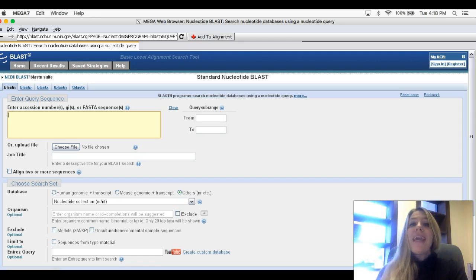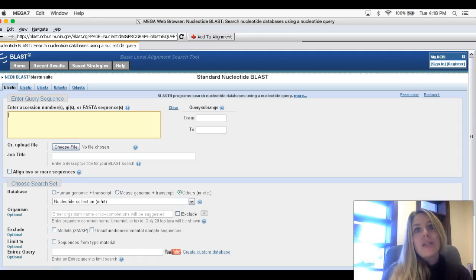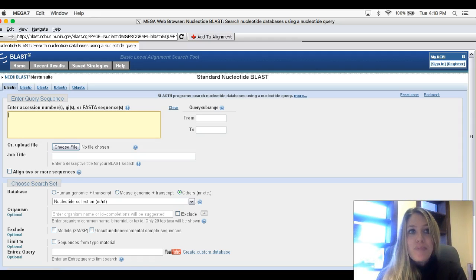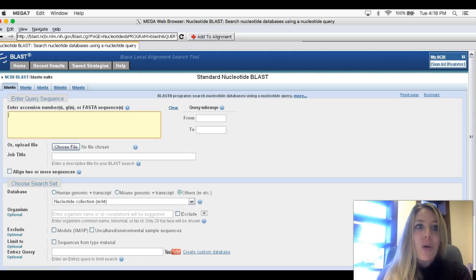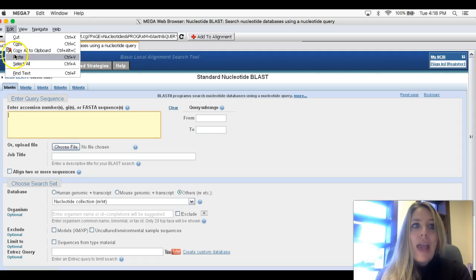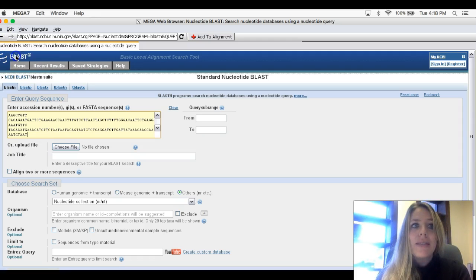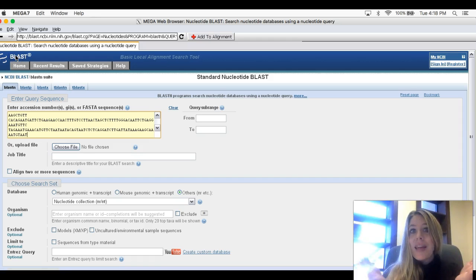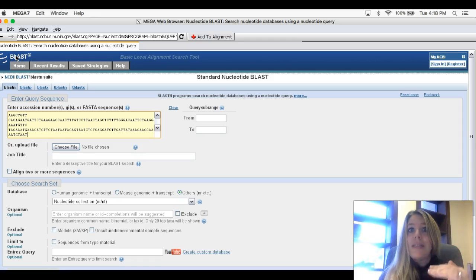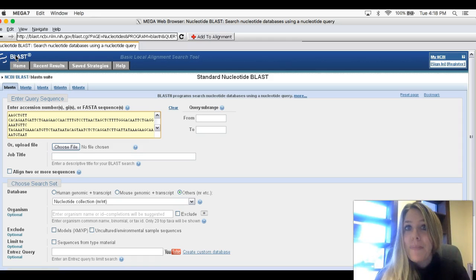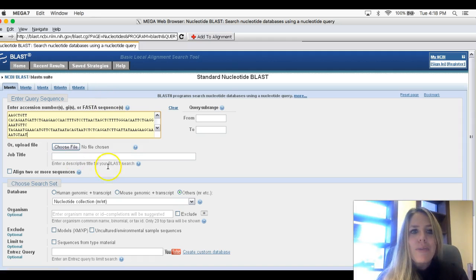Now we want to paste in the DNA sequence that we just copied. I'm just going to go up to my Edit and Paste. And I just pasted in that exact same bit of DNA sequence that we copied on the previous page.